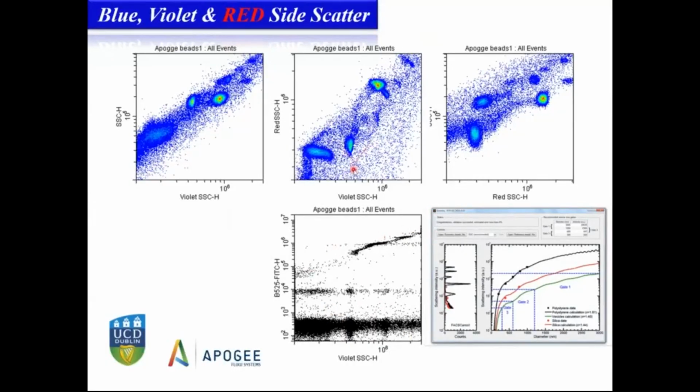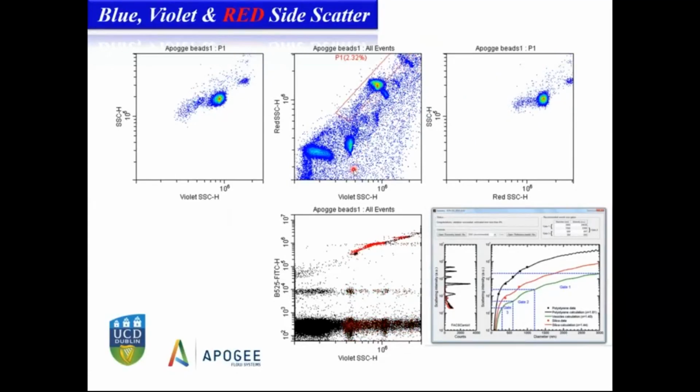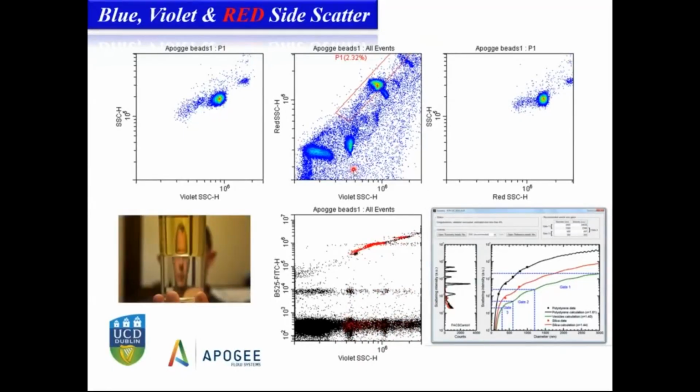What if we select one of these diagonals? When we select one of those diagonals, they look like the unlabeled ones. If we look at the other diagonal, we can see that they are the labeled ones. So depending on the composition of my particles, the refractive index could be different and the proportions of the scattering could be different.